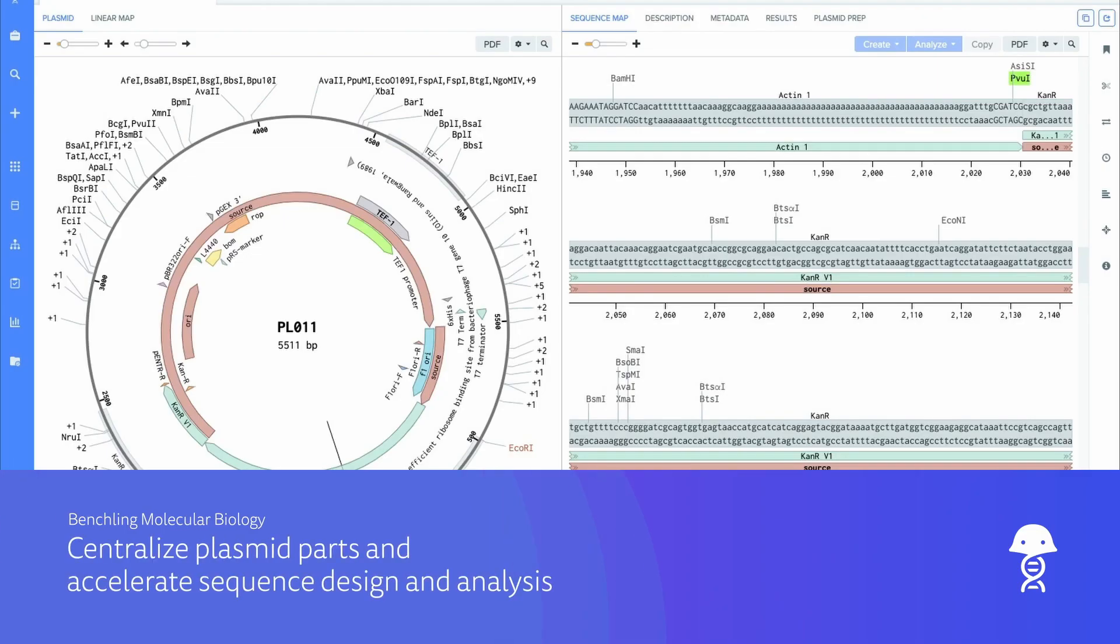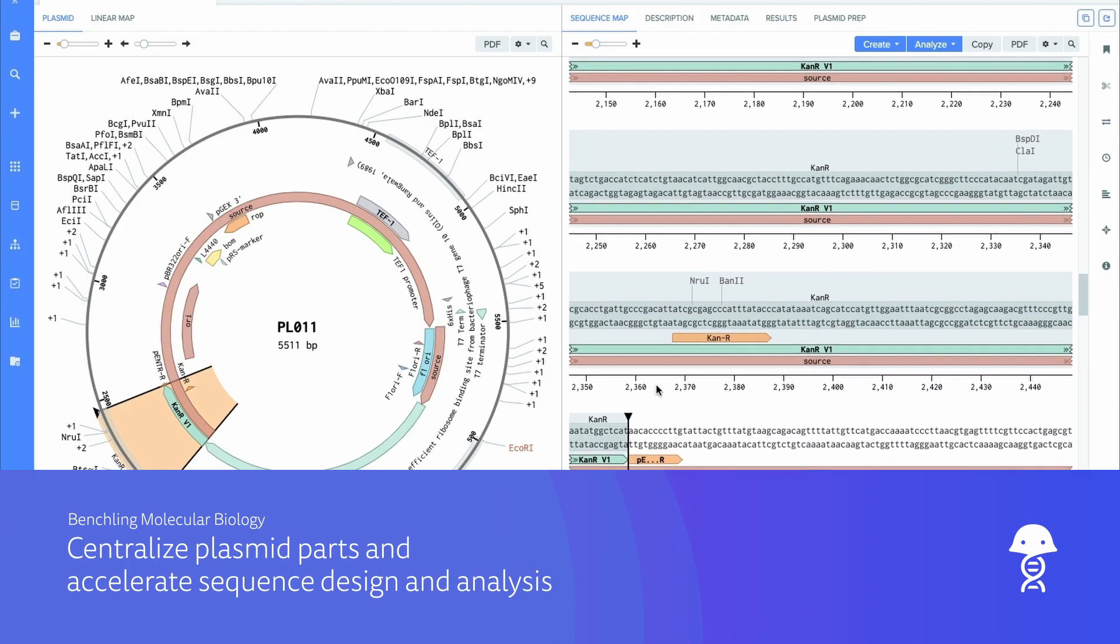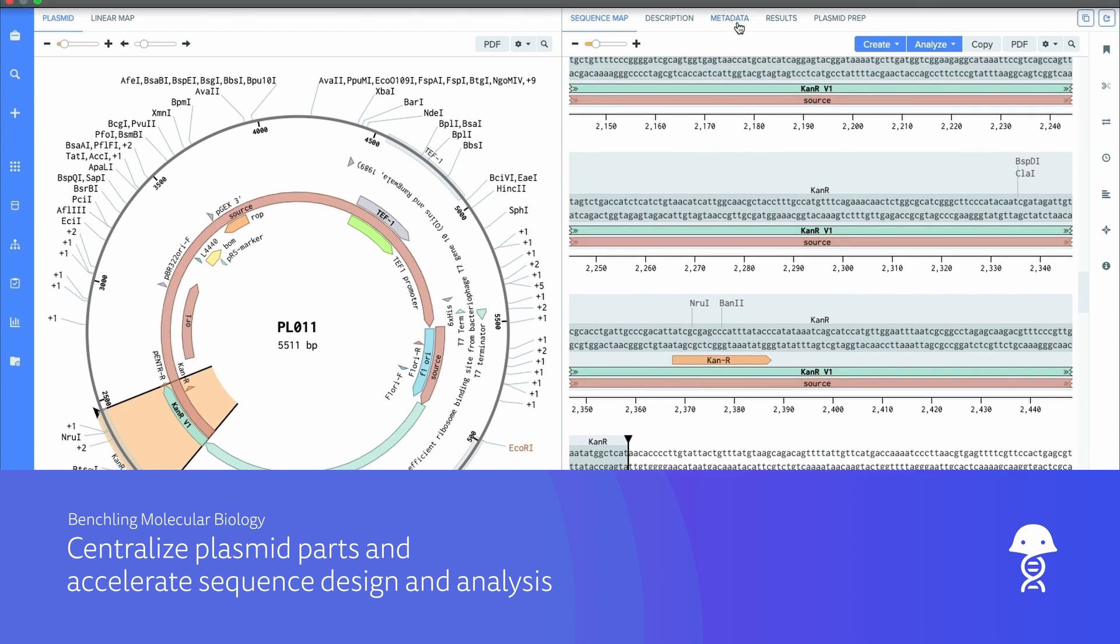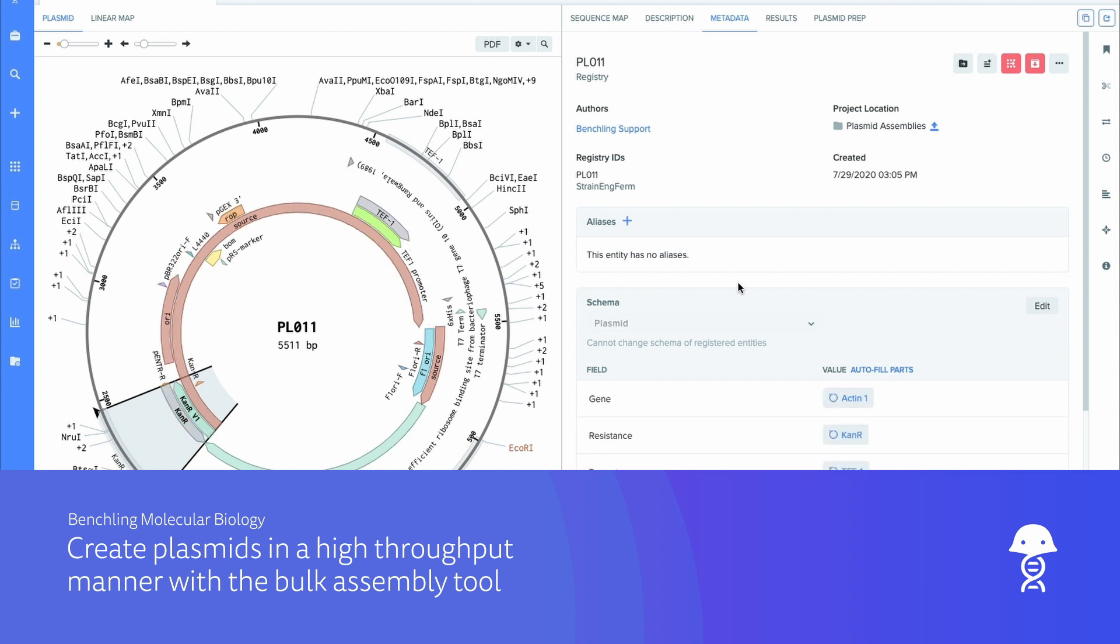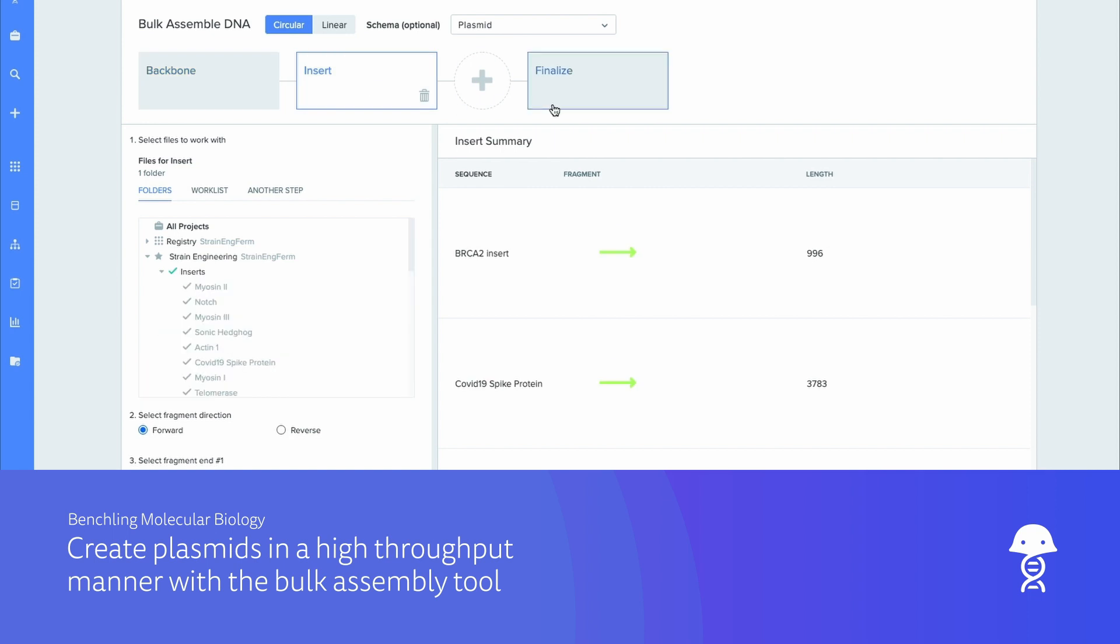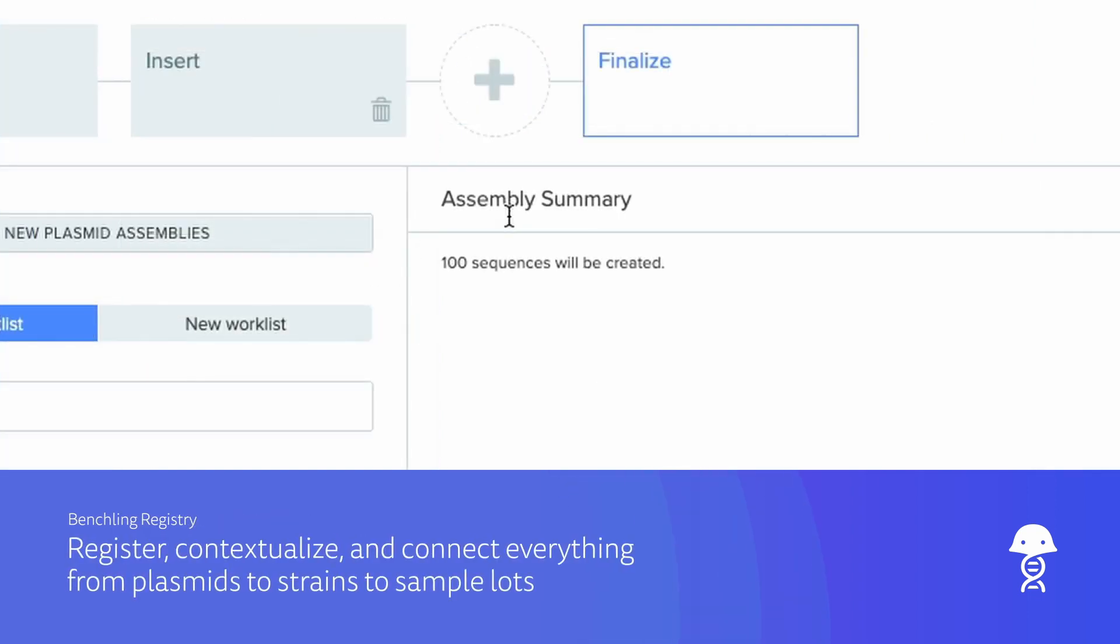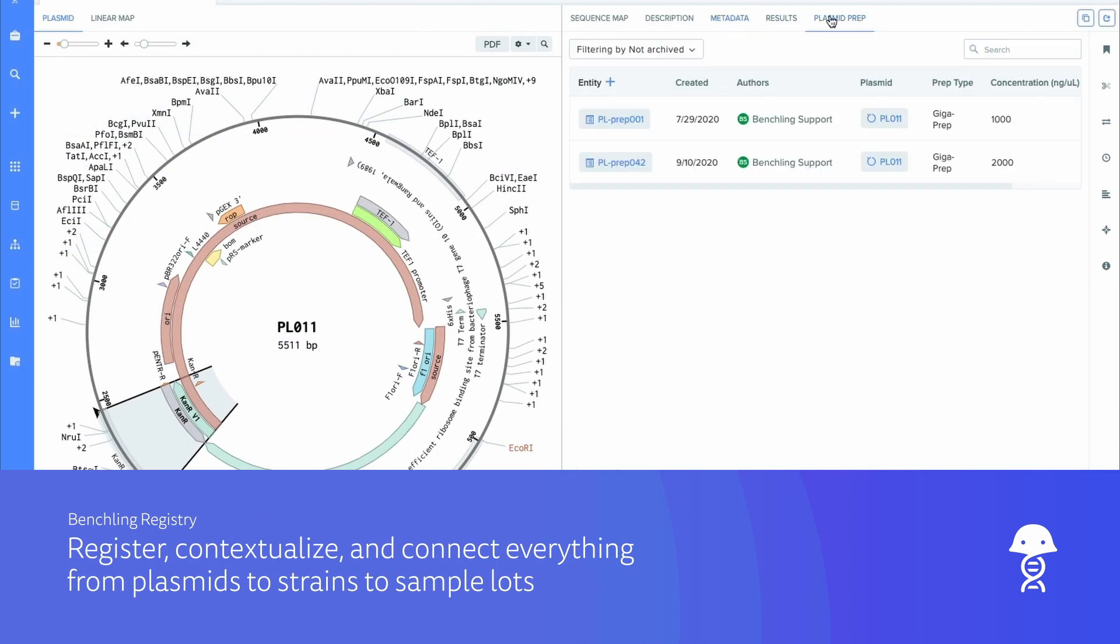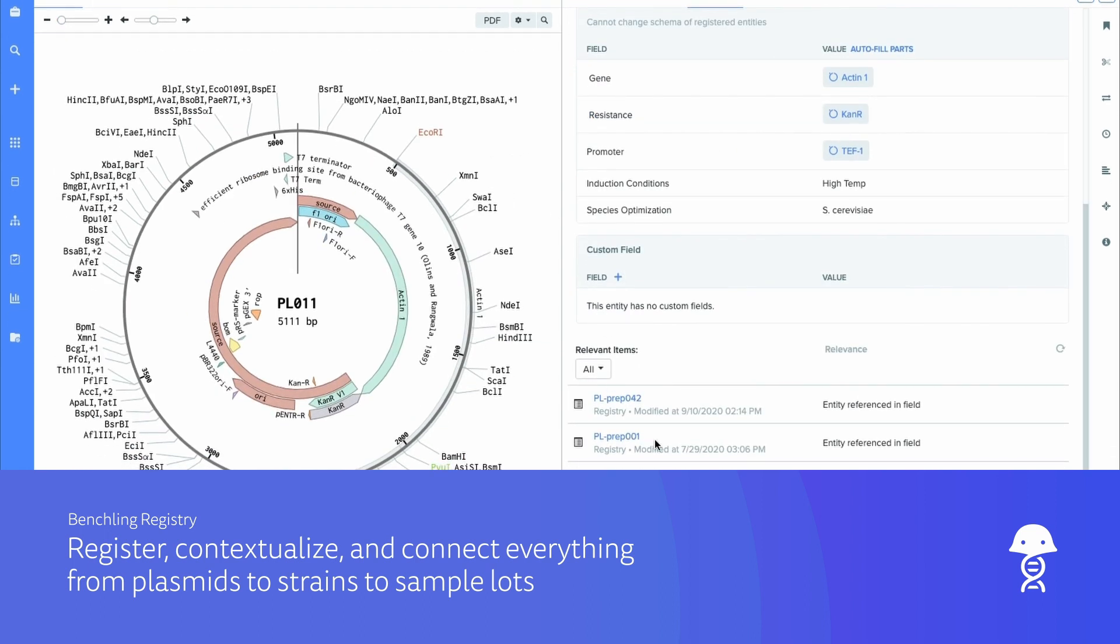The complexities of plasmid design are made simple in Benchling, which enables strain engineers to build, analyze, and track plasmids in bulk. Store plasmids and their parts in a centralized repository. Perform high-throughput sequence design and analysis in bulk. And automatically link plasmids, strains, and strain banks together, all while tracking sample lots.